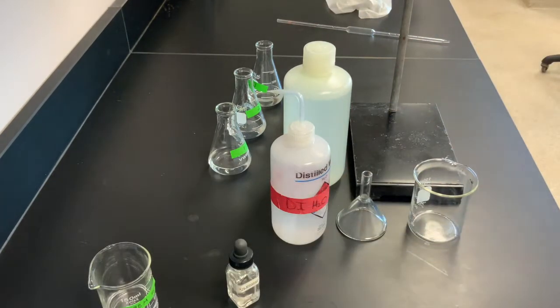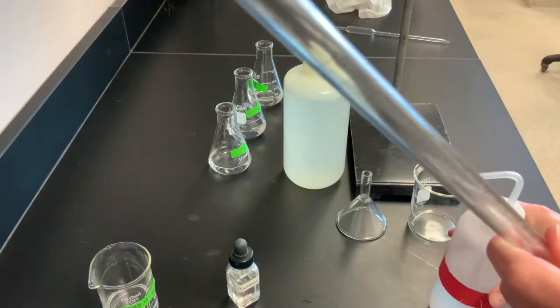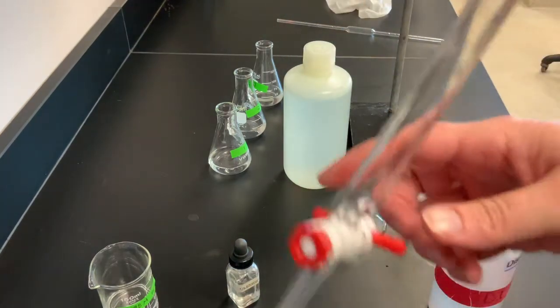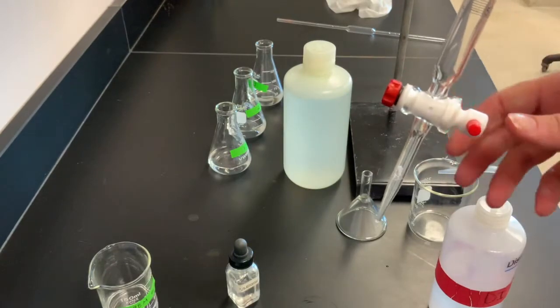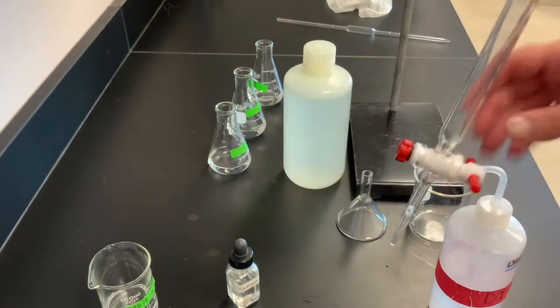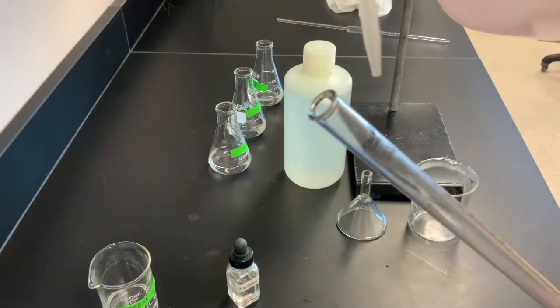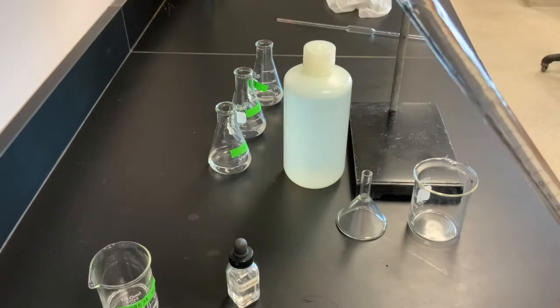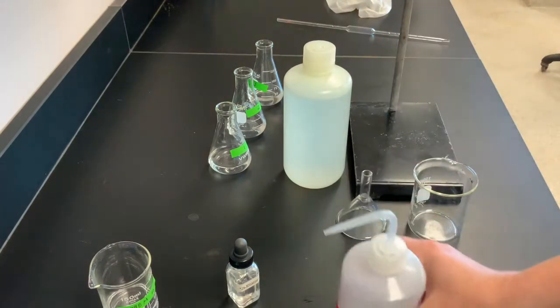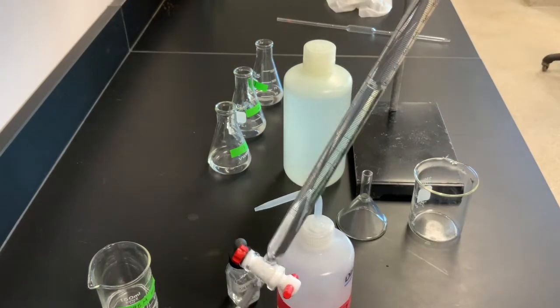So I've got my burette. We're gonna add some deionized water. We want to make sure the stopcock at the bottom is closed. So when it's turned sideways, it's closed. We're gonna pour some deionized water in it, making sure we coat the sides. So I haven't filled it completely. I just have a little bit of deionized water in it.